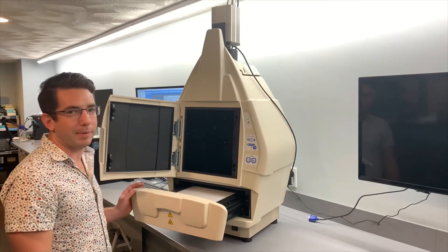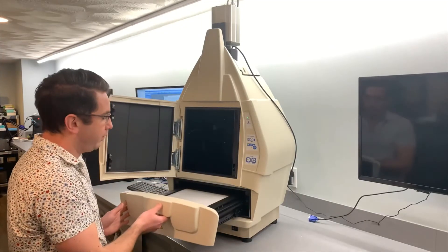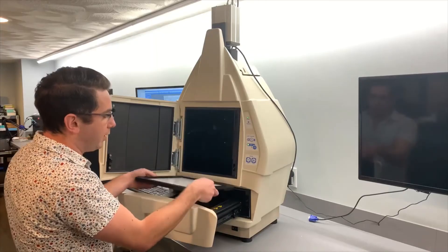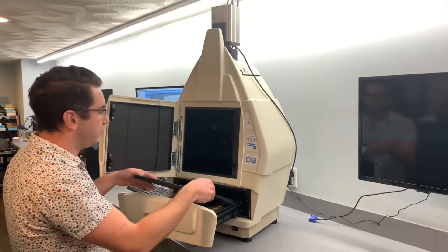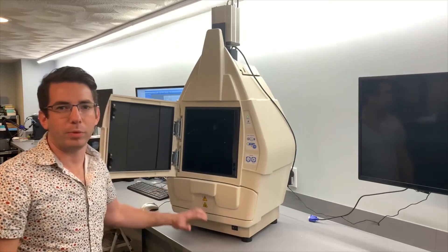Included in every Chemidoc MP is a UV transilluminator, an optional white light conversion screen, as well as a computer loaded with ImageLab software.